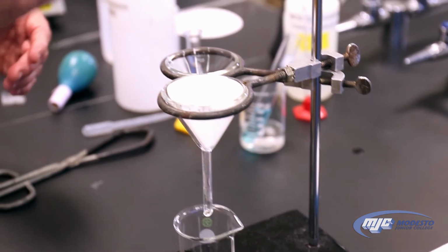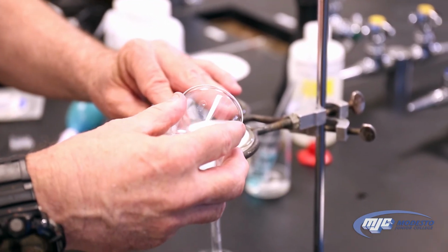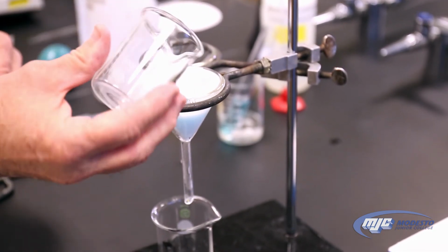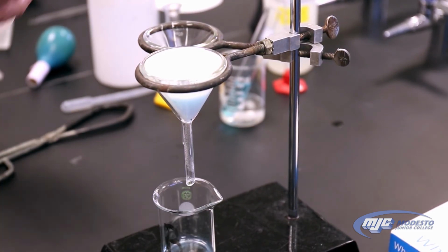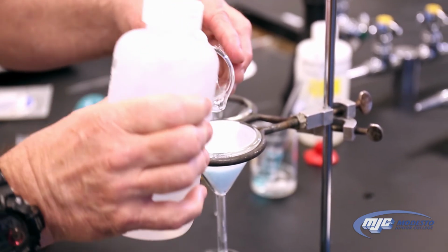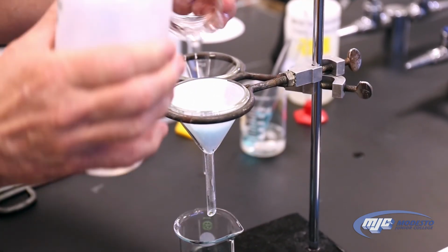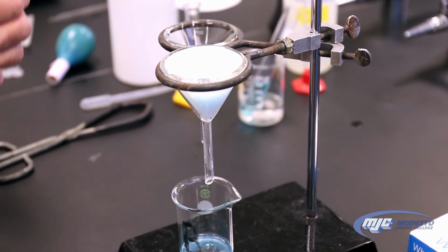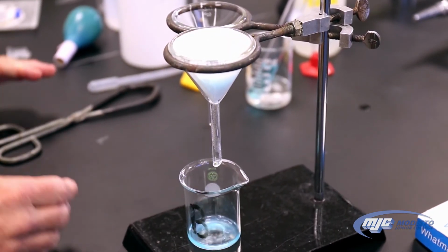I'm going to take this and filter the lead 2 sulfate out. Pour it through. There's going to be some lead 2 sulfate in there. We want to get that out, so just use some DI water. Our goal is to get every single atom of lead transferred if we can. Now we wait for that to filter.